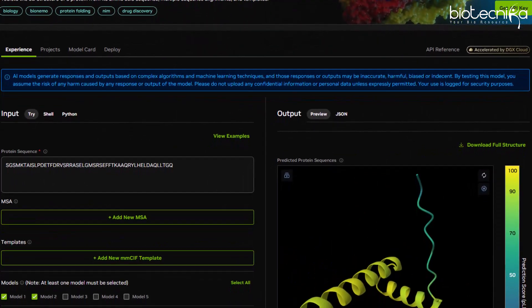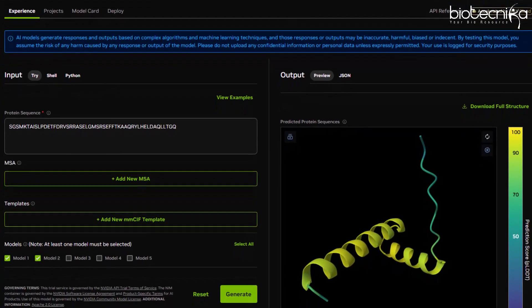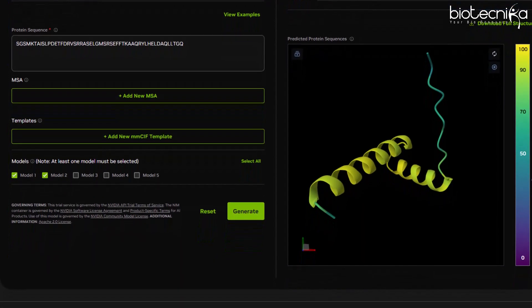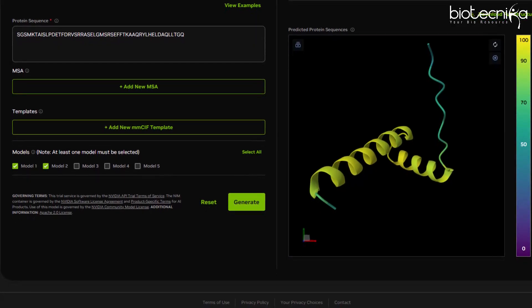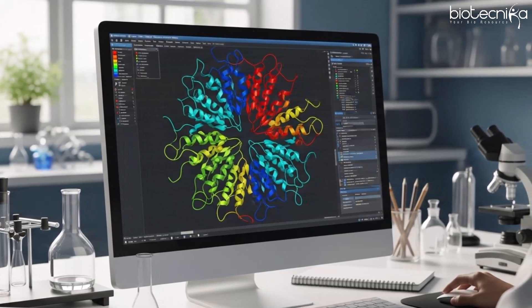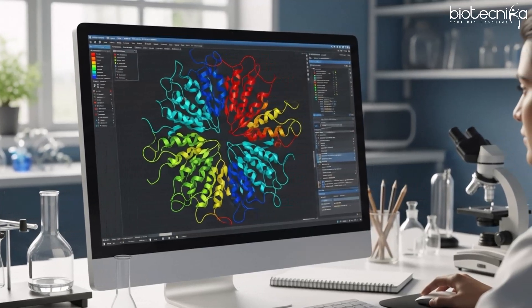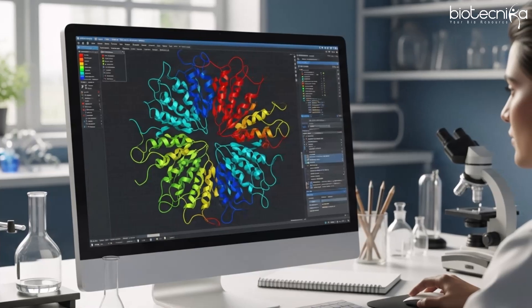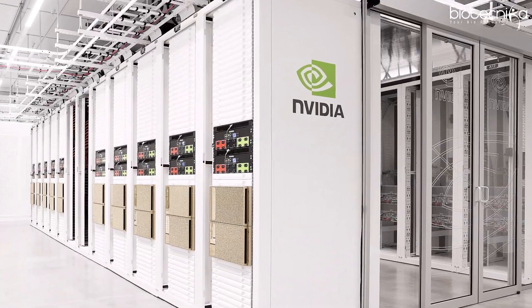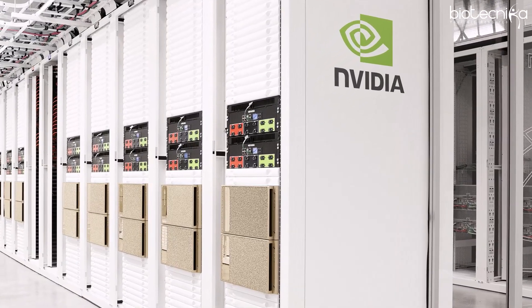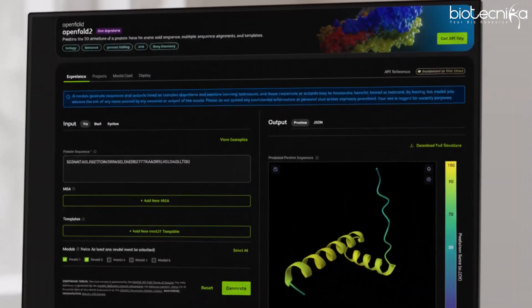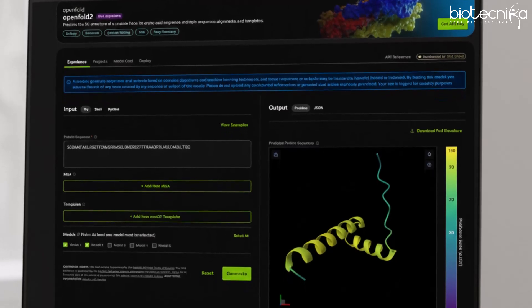Today I'm going to show you a particular server maintained by MIT — Massachusetts Institute of Technology from the US. This particular server is powered by NVIDIA, so basically a supercomputer is there in the background doing the job for us. Doing protein modeling, especially a very large protein, in a very less amount of time is a cumbersome process and your regular system won't be able to do that. That is why we use cloud servers, and this particular supercomputer cloud server is available to everyone for free. If you are using a cloud server you can also surpass the barrier of your OS — whatever operating system you are using.